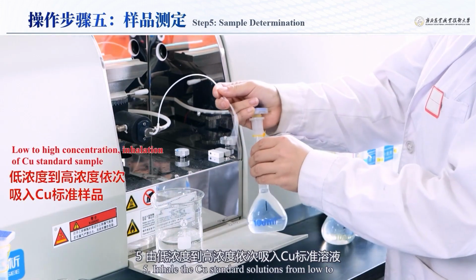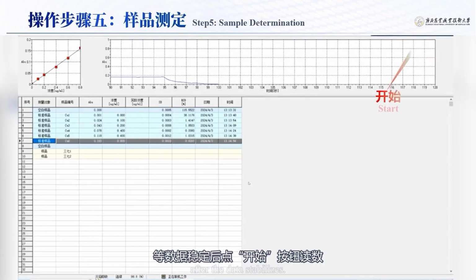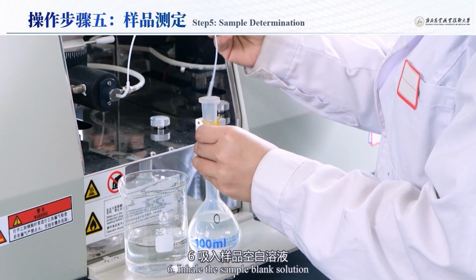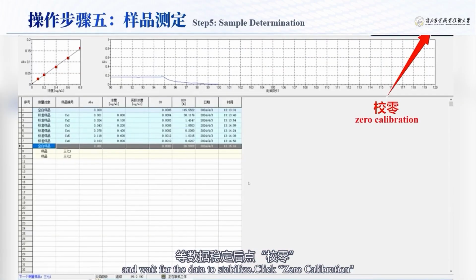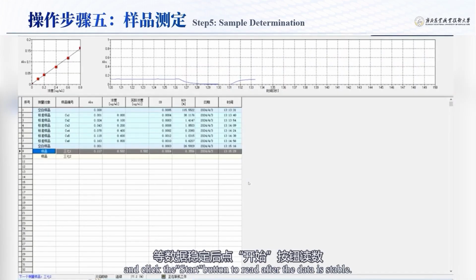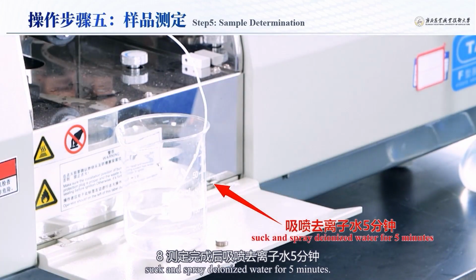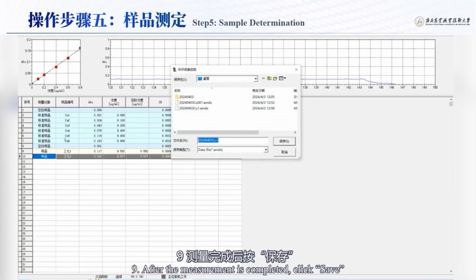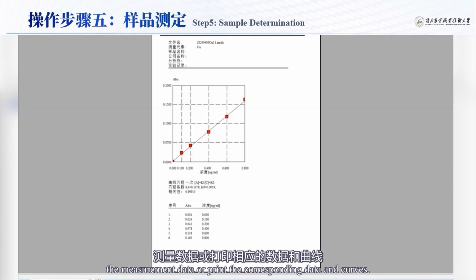Fifth, inhale the Cu standard solutions from low to high concentration and click Start to read the data after the data stabilizes. Sixth, inhale the sample blank solution and wait for the data to stabilize. Click Zero Calibration. Seventh, inhale the Panax notoginseng test solution in turn and click the Start button to read after the data is stable. Eighth, after the measurement is completed, suck and spray deionized water for 5 minutes. Ninth, after the measurement is completed, click Save or Print and follow the prompts to save the measurement data or print the corresponding data and curves.